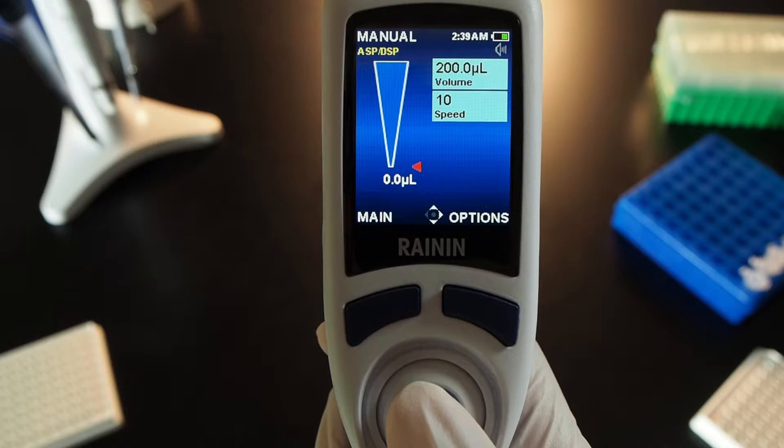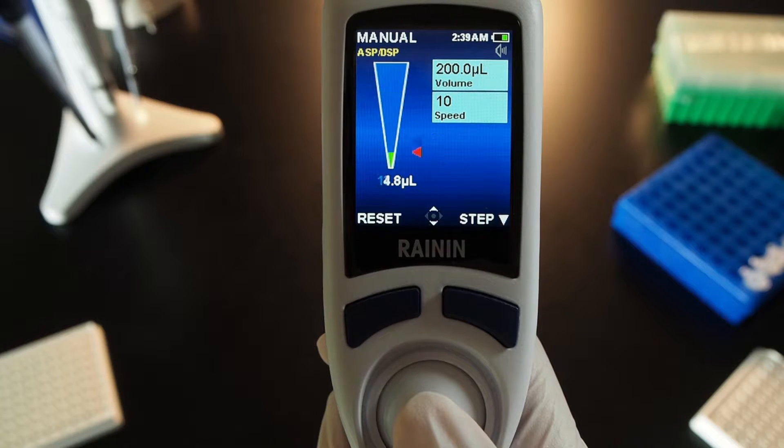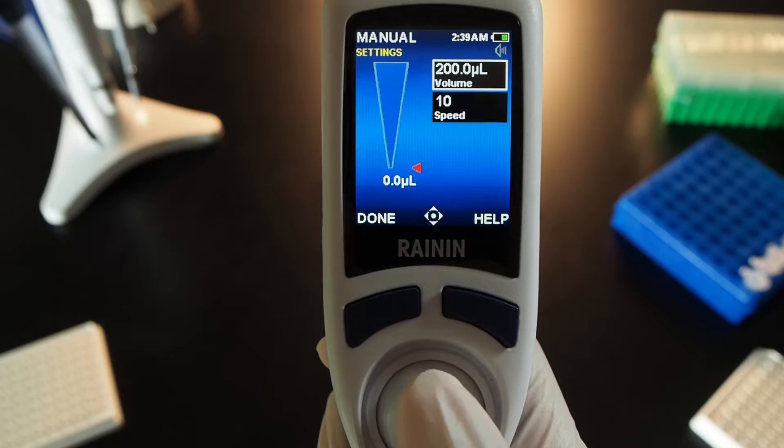For basic manual pipetting, push the joystick up to aspirate. Manual mode makes it possible to continuously and incrementally actuate volume control. Nudge the joystick down, then nudge it up. Push downward and hold to completely dispense. Move the joystick right to go into settings.